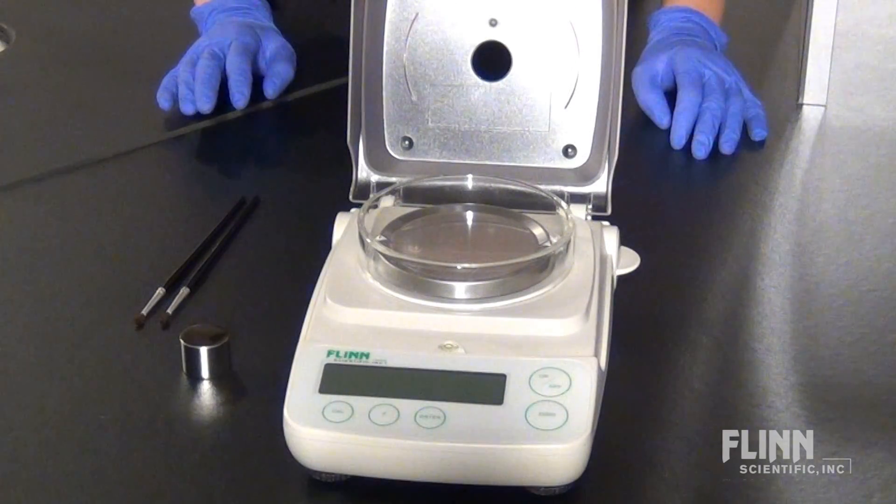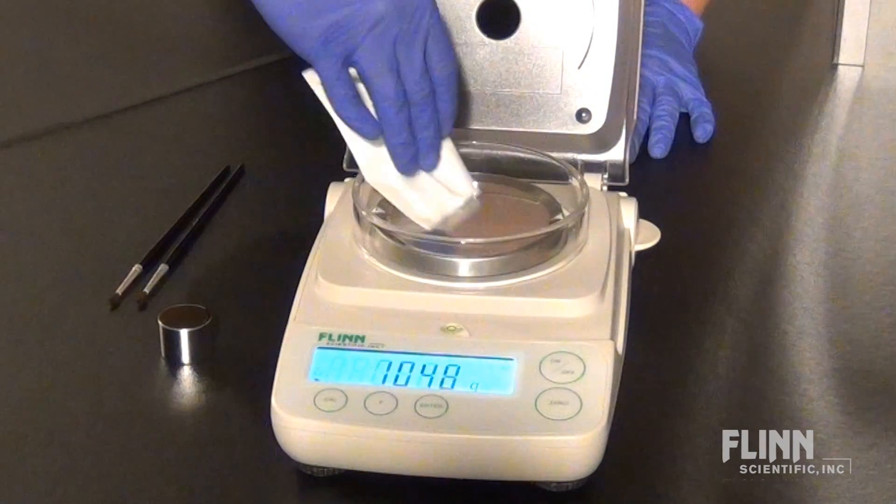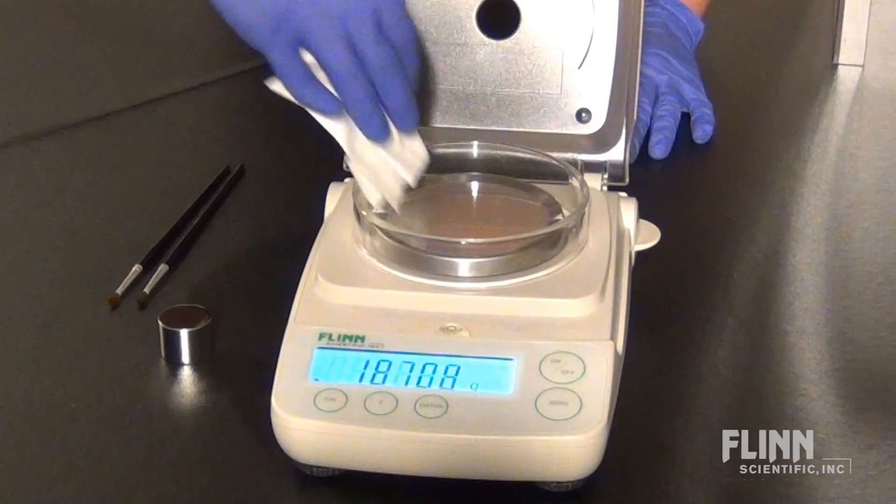When you turn the balance on, allow it to warm up for 1-2 hours before use. It is important to remove all chemical residue with a tissue or small paintbrush.